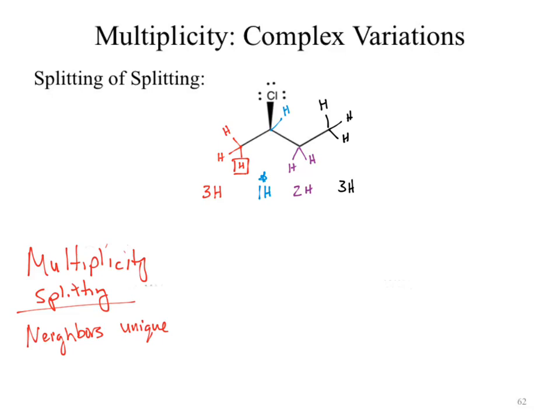If we look at our red hydrogen, we want to count neighbors. The first thing we need to do is recognize this 3-bond rule, which I'm going to put in quotes until we fix it. Everybody seems to remember the 3-bond rule and quote it like the Bible. It's not 3 bonds. It is actually a little bit less defined than that. It is less than or equal to 3 bonds, 99% of the time. So let's count out our 3 bonds.